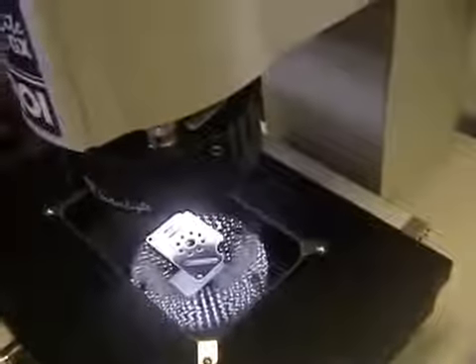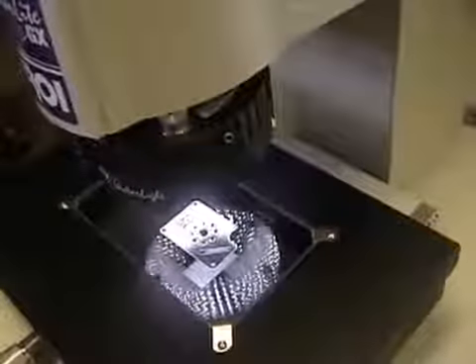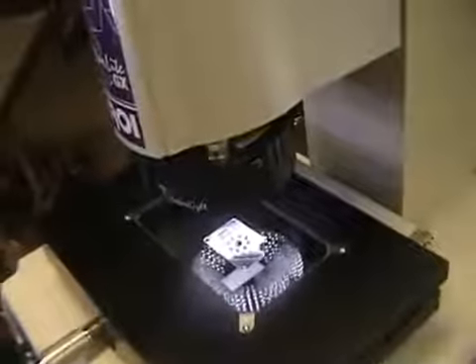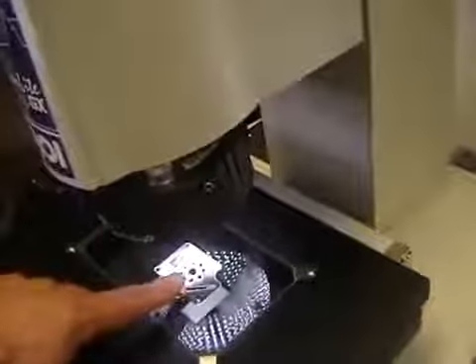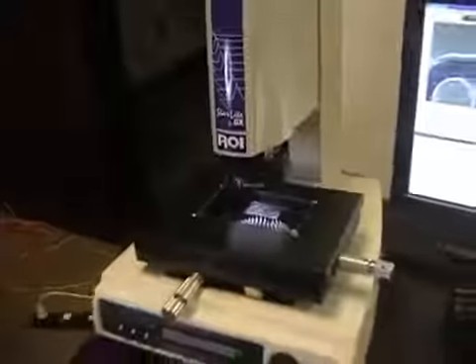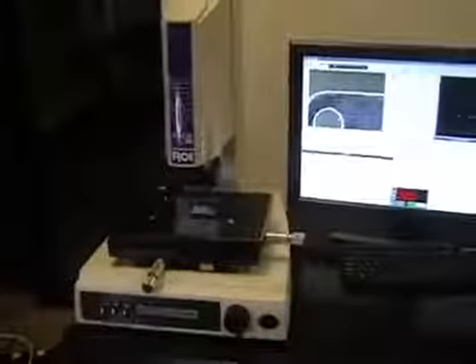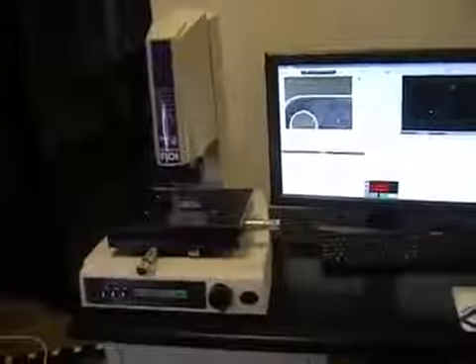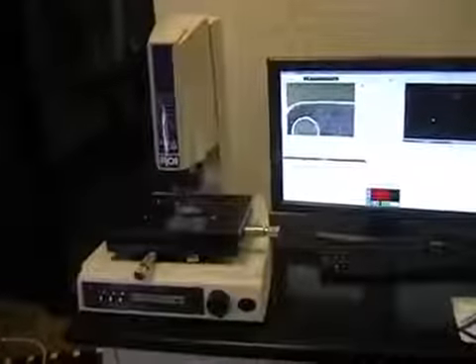This often helps with imaging and we might be able to see this later as part of the demonstration making measurements on a part. On the stage here we see a small sample part. We'll be doing some exercises with that in a moment. And that is the summary of the mechanical and optic setup for the RAM optical Starlight GX.